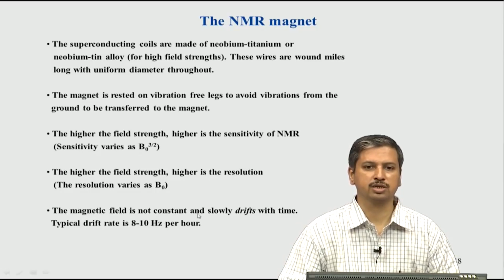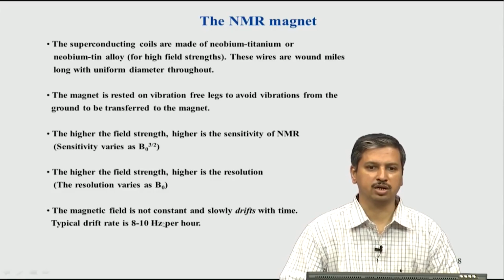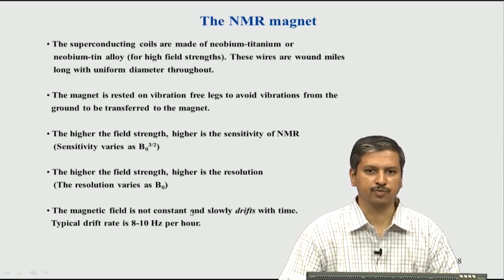We are correcting for the drift in the spectrum, but we do not correct it in reality, in the sense that the magnetic field continues to change, to drift, but internally we try to correct it by applying a mechanism which we will see.